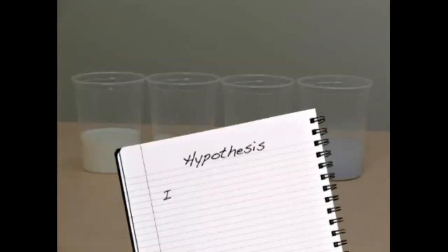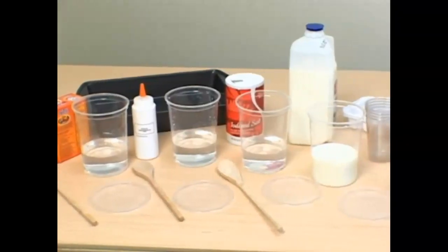A good hypothesis often takes the form of a prediction. In this case, the lab will help you confirm or adapt your prediction. For example, if we mix salt and water, then the resulting mixture will be what? As we go through the lab, you will learn how to determine this. We prepared for the lab by gathering these materials.